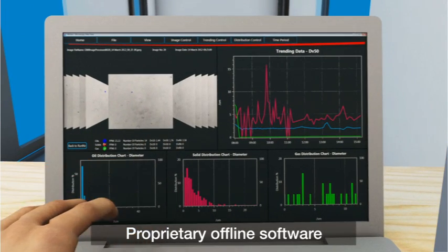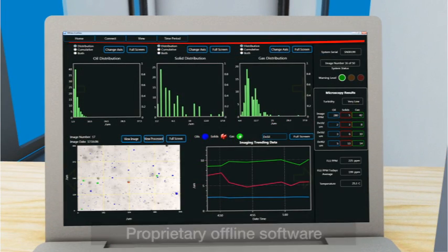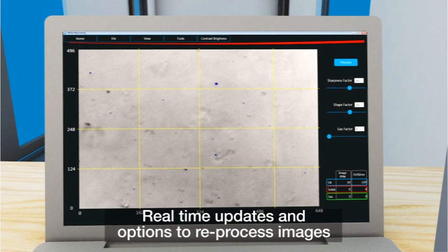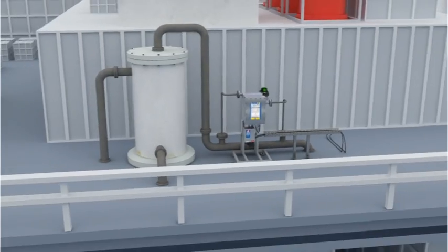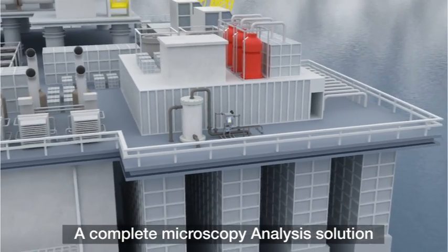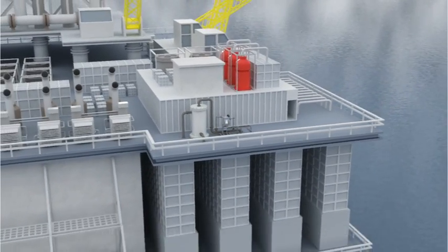To allow for real-time monitoring and for further analysis and review, Advanced Sensors have developed proprietary remote software. This unique feature continues Advanced Sensors' goal of meeting customers' demands today and future needs tomorrow.